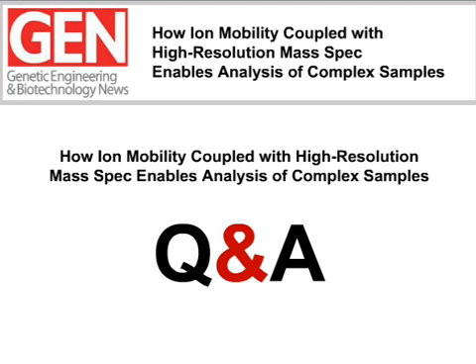Good. Those questions were relayed, and I think you answered them perfectly. Thank you. Hey, Aaron, I have a question here. Bear with me, this is a long one. Don't answer yet. I am trying to purify bacterial toxins from milk and then quantify the toxin using labeled internal standards, online SPE, UPLC, TQ, and MRM. The purification does not seem to work properly, and there's interference from milk components. Would IM help without more purification?